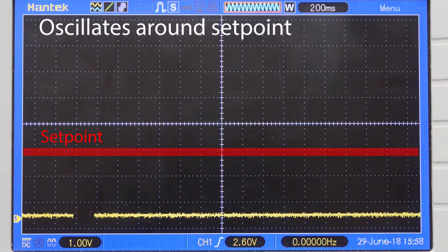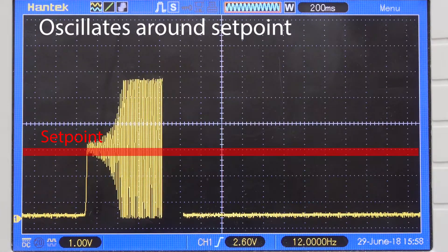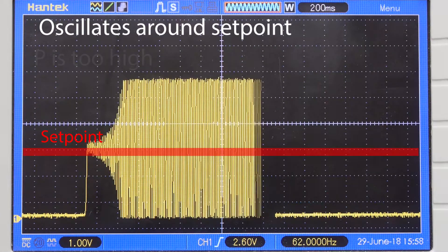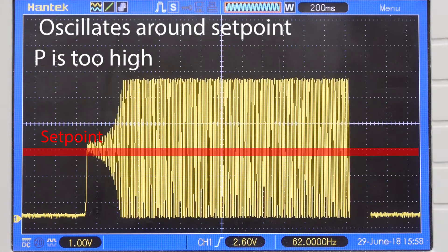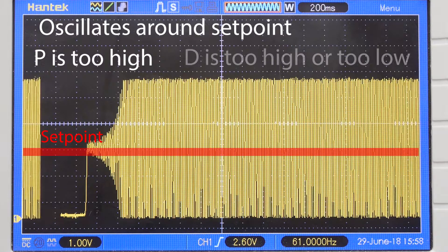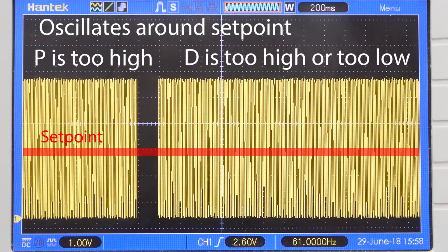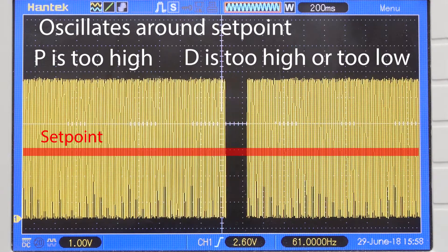And if your flow controller oscillates around your setpoint, your P setting is too high and your D setting is too high or too low.